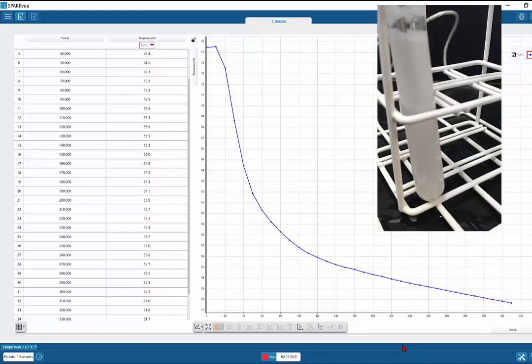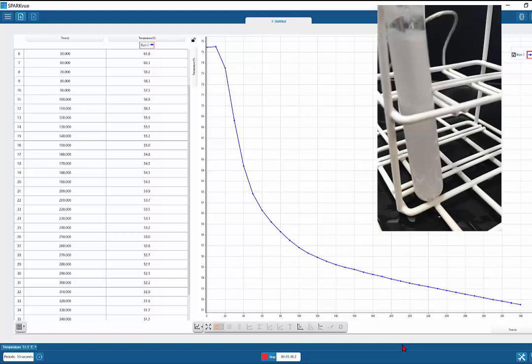Okay, so there's two things to get from that. Where the kinetic energy goes. Kinetic energy goes in changing state or in cooling, either forward or reverse. You don't get the drop down here because we didn't put it in ice. And that's it.